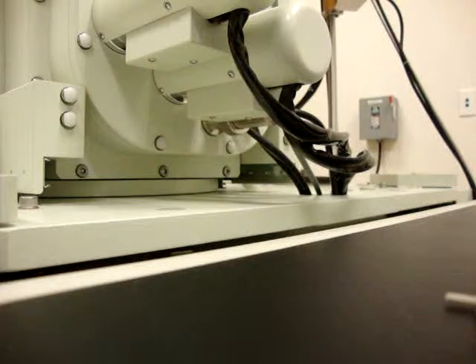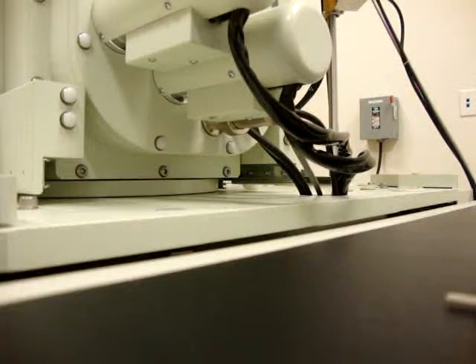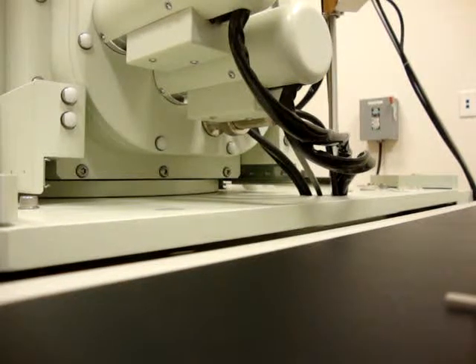Okay, I'm getting bored of this. If I want to stop it, can I stop a photo halfway, if I realize that this is not what I want? Sure. Can you get another button? That'll work, and unfreeze. Is there a report button or something? You just click the camera button again. Ah, okay. And then press the freeze button, because it was frozen. Yeah, you unfreeze it. Before you can get another picture, you have to unfreeze it, right? Yeah, because it was going to scan and freeze.